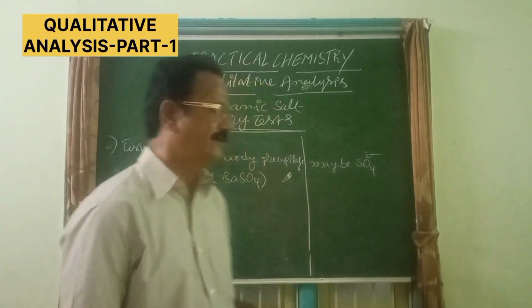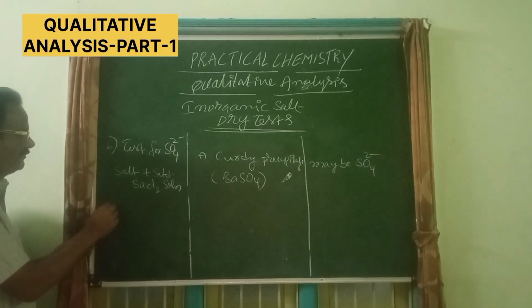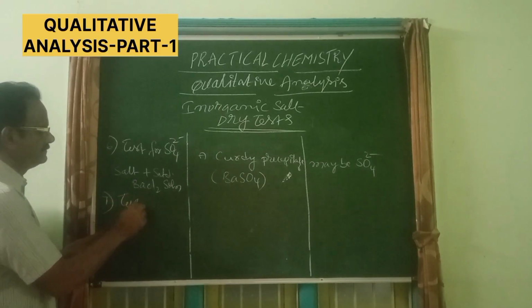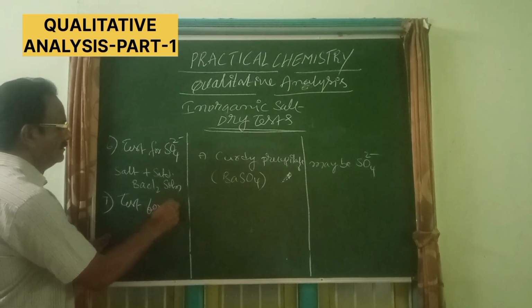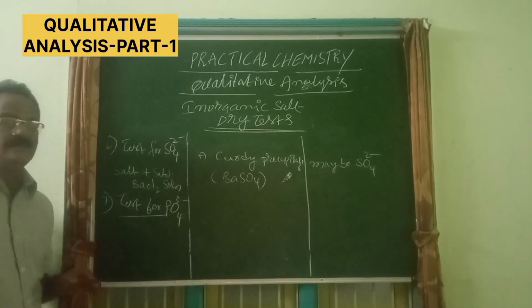Now let us go for another test, the test for phosphate, PO4 3 minus. This is a most important test.